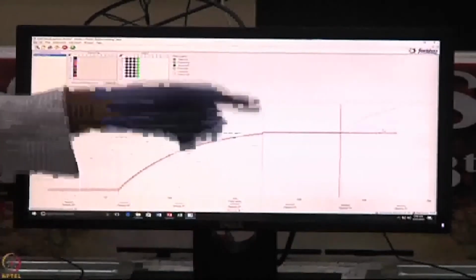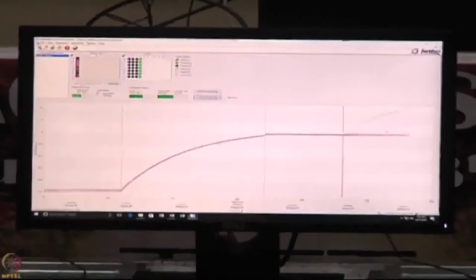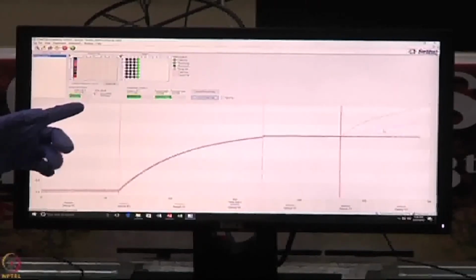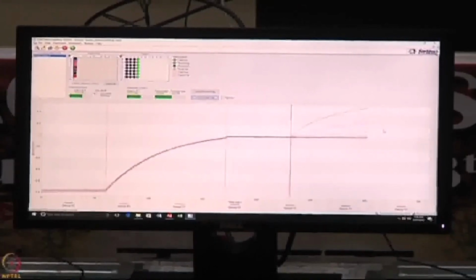So nice dose distribution. I think the lower ones are not picking up, in the sense that the samples are too diluted, or otherwise we have to extend the time. It has to come very nicely in the dose distribution, because we had just put around 120 seconds. Probably we have to extend it by another 60 or 120 seconds, so the lower ones will also come very nicely. So let's acquire for 120 seconds.